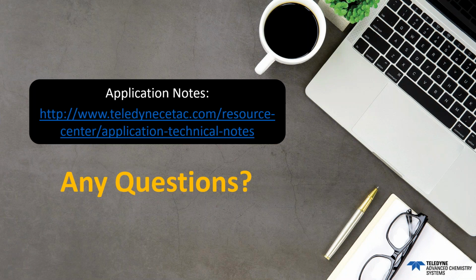Okay, this is a really good question. That's how do you adjust for the higher viscosity, like with coolant samples? So the SimPrep has a lot of options for optimizing the method to work for your samples.